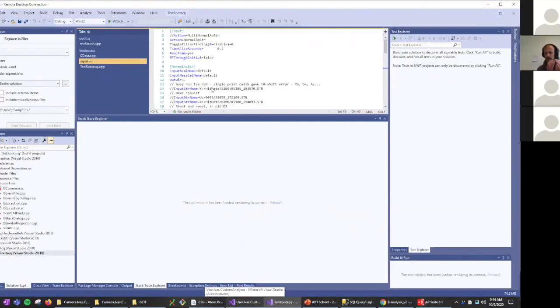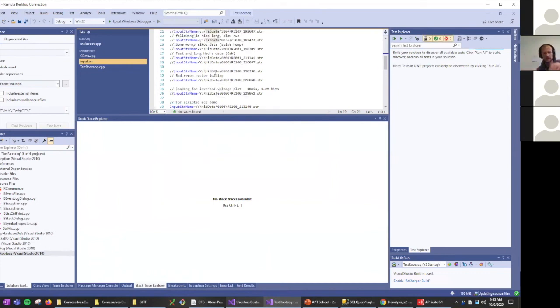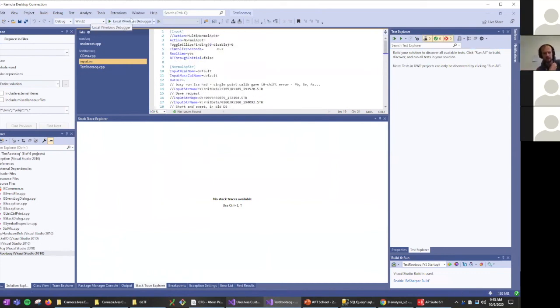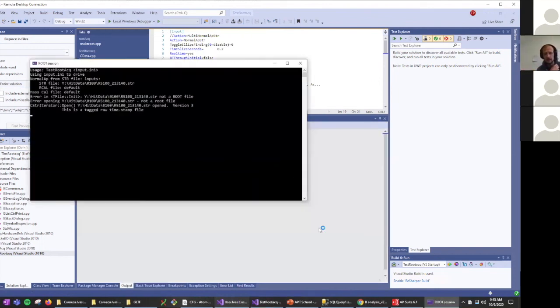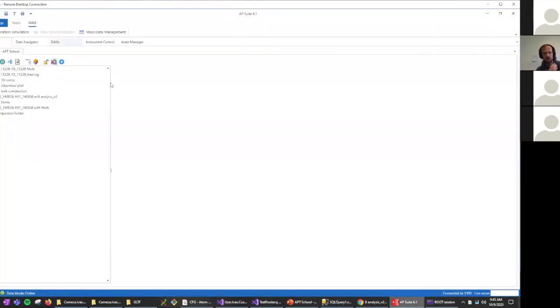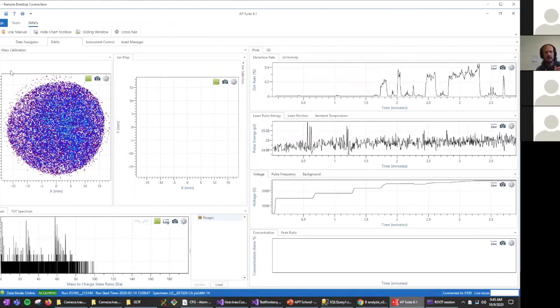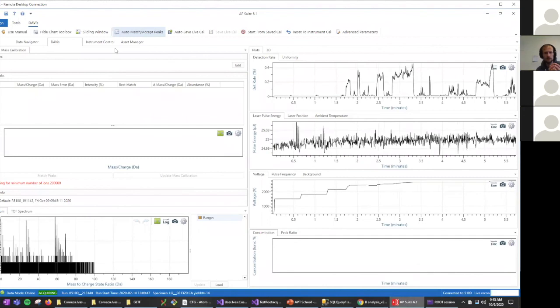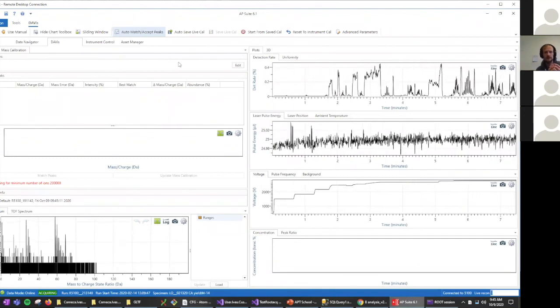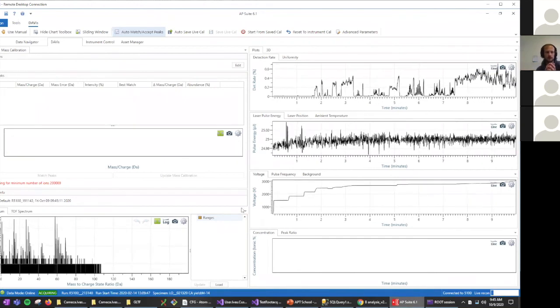okay, if we partition the entire life of an atom probe specimen up to its role in a publication into different stages, like the proprietary side of a company, the detector, measurement, and post-processing and analysis. What I think would be most useful for the community is to define clearly and communicate clearly what should remain proprietary and what is post-processing from a numerical point of view, and that should be made, if possible, as open as possible.